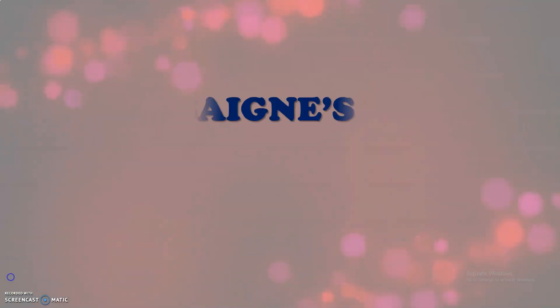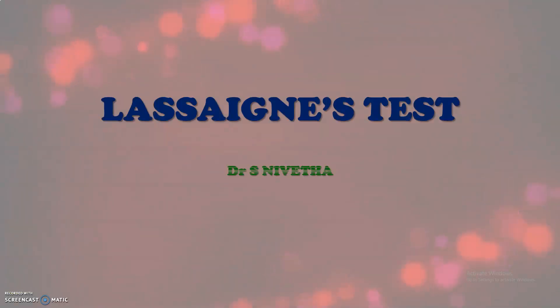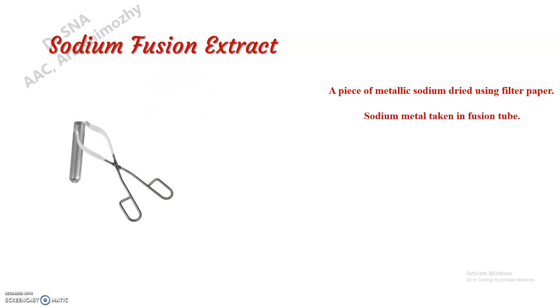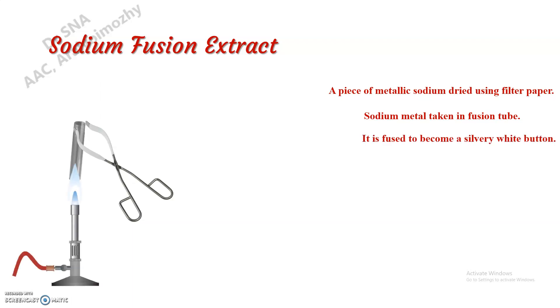First, let us see how to prepare sodium fusion extract. Take a small piece of sodium and dry it well using filter paper, then add this into a fusion tube. Now we have to fuse this sodium into a silvery white button by gently waving this fusion tube in the flame.